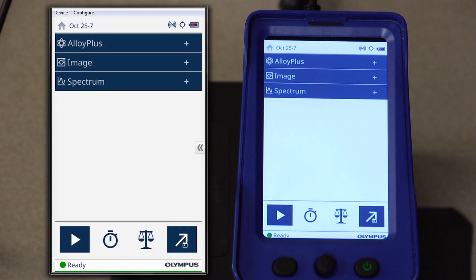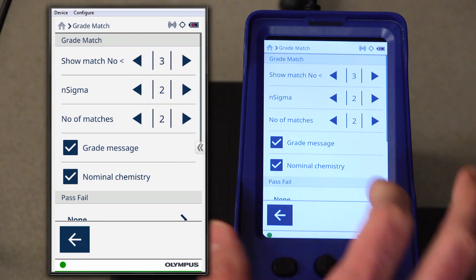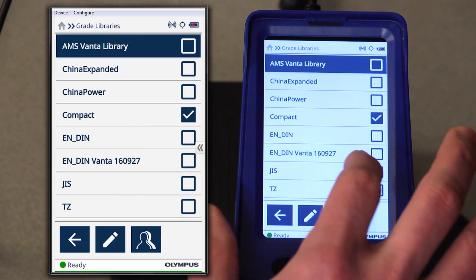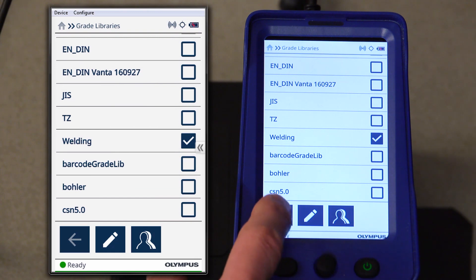Next we'll want to select the grade libraries for weld analysis. To do that, we will select the grade match icon at the bottom of the screen and scroll down to libraries, select the arrow to access the libraries, and we want to select our welding library.